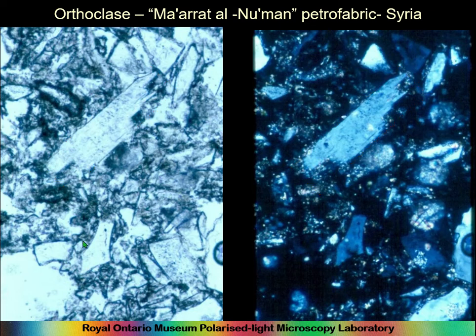And so if you look at this here, you can see this is probably quartz, not certainly quartz, because this is broken into an angular, shardy type of shape because there's no cleavage in it. It has these conchoidal-like fractures is how it's broken. And so when you see these angular shapes, you're thinking this is something with no cleavage. This is like quartz. Whereas a feldspar will often break into blocky, squarish, orthogonal sort of shapes.